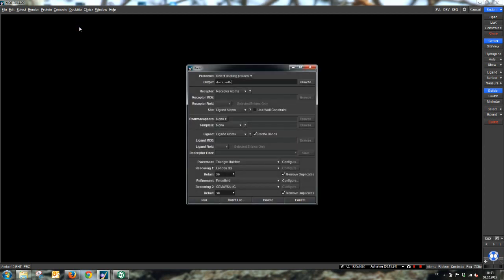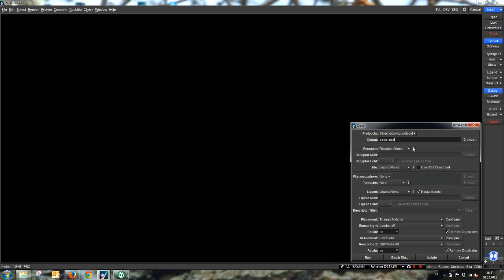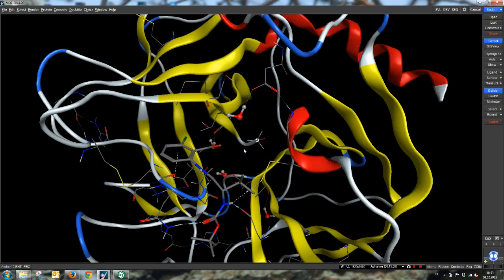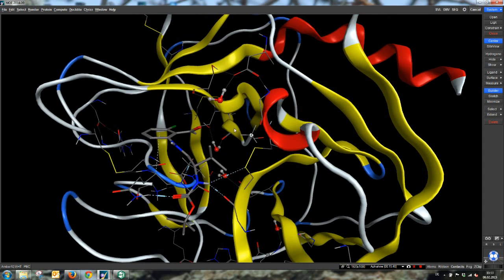Okay, now we come to the final docking step. For this docking step, we use just the dock graphical user interface of MOE, and we open our 1INC ZER-DEL MOE receptor file. Because we will dock in this one, the nucleophilic residue is now part of the ligand, so we had to delete it.